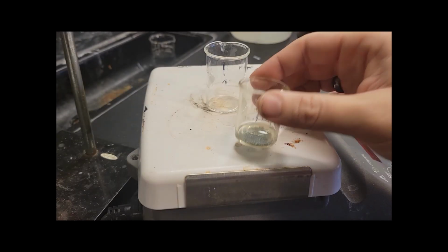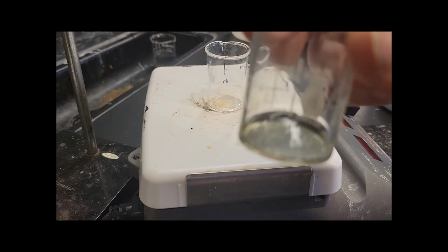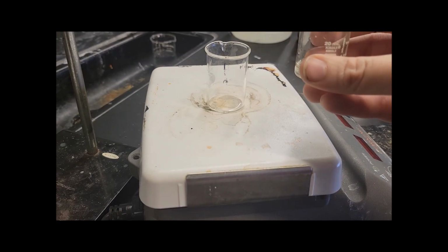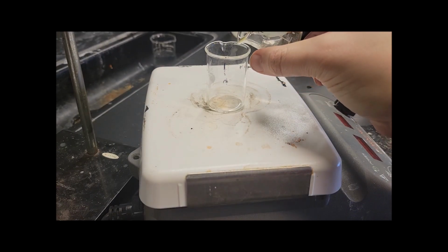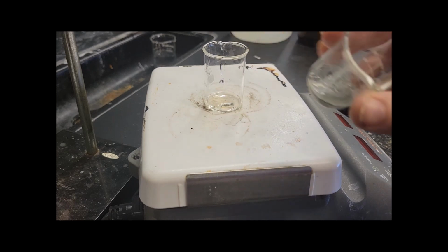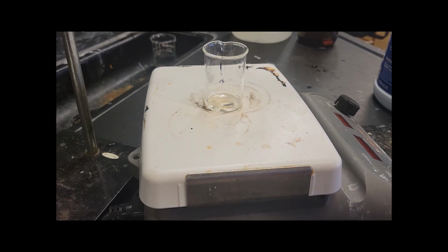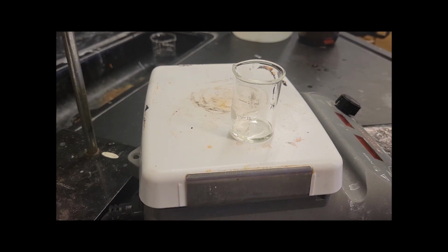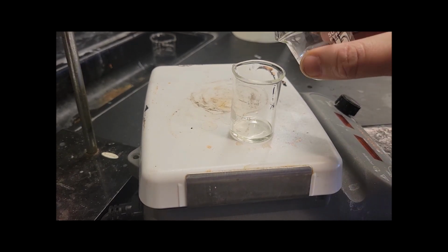After multiple additions of zinc, see how the solution is essentially colorless. I'm going to pour this off and react it with bleach. Colorless. Now what should happen if I add bleach to this? Adding bleach.